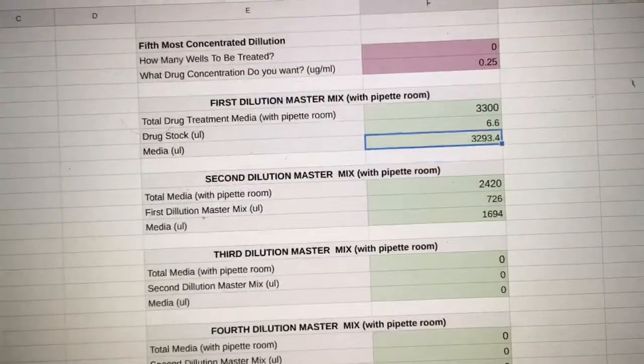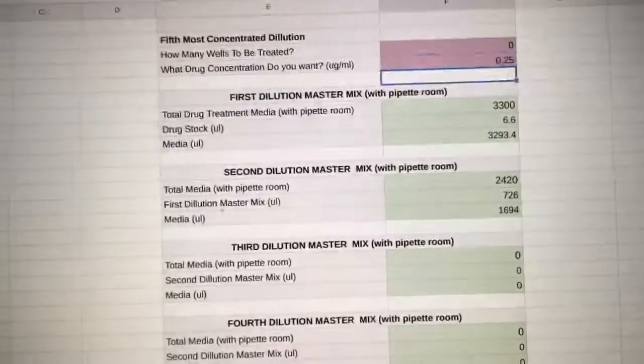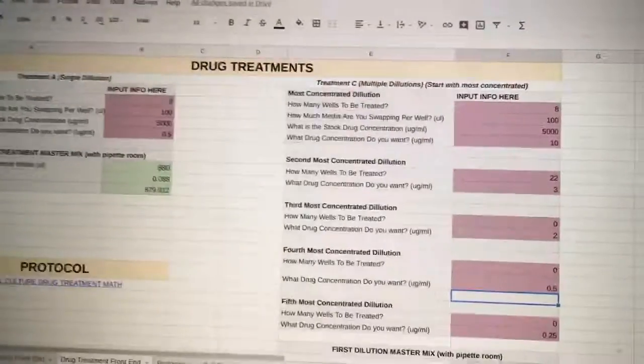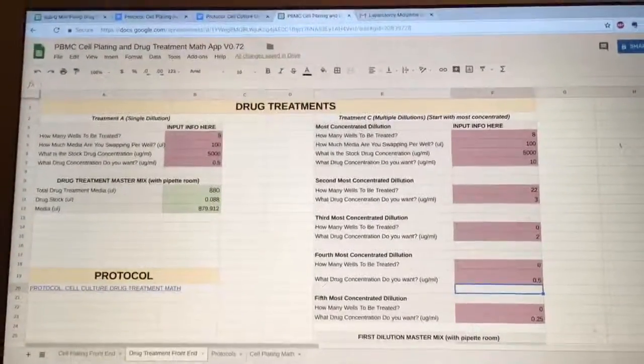And then that'll update the numbers all the way up this little tree here, and hopefully save a lot of time. I think it'd probably save like an hour total of our time each time we're in the protocol. So that could be pretty cool.